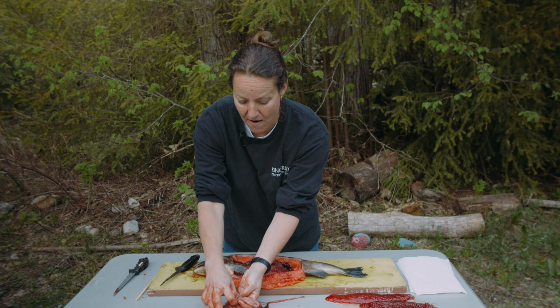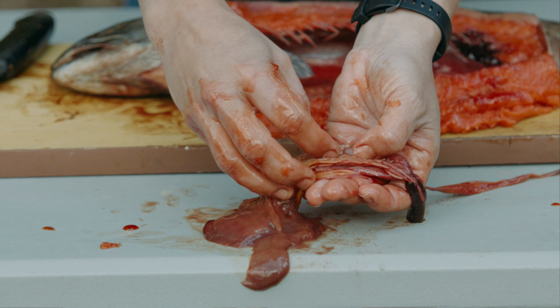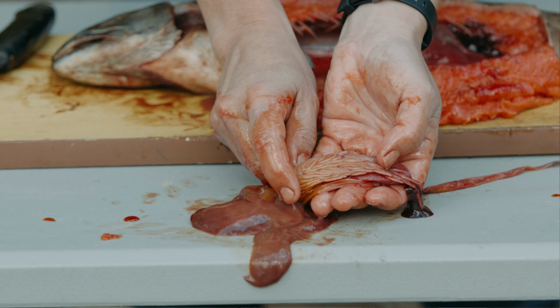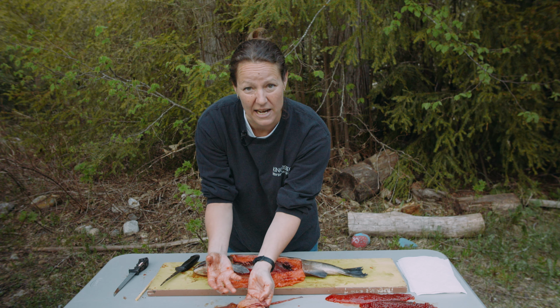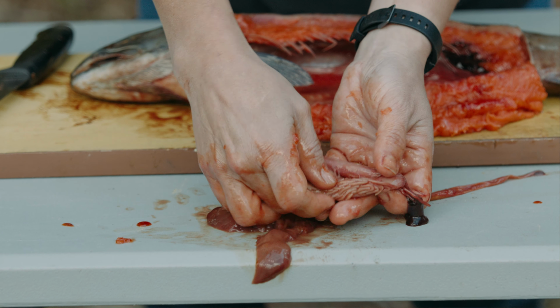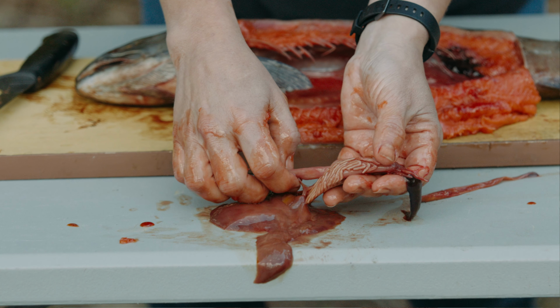Okay, now we have something pretty cool here. Kind of looks like spaghetti. Well, this part of the fish's digestive system is called pyloric ceca, and no, you don't need to remember that. That pyloric ceca is kind of like our small intestine, and it helps get the nutrients out of the food. And the stomach itself, we saw right here, which is empty.